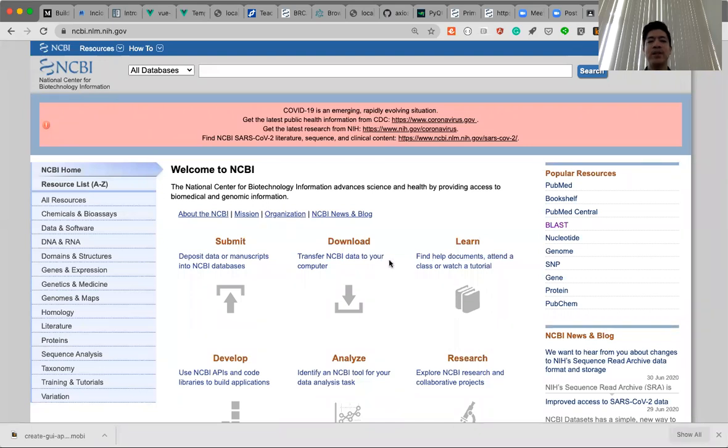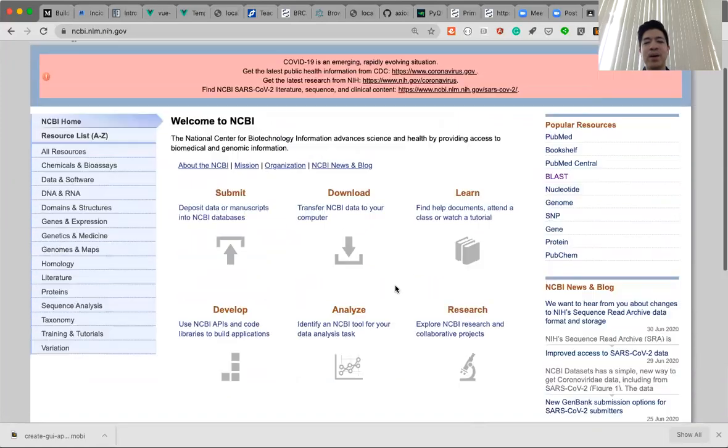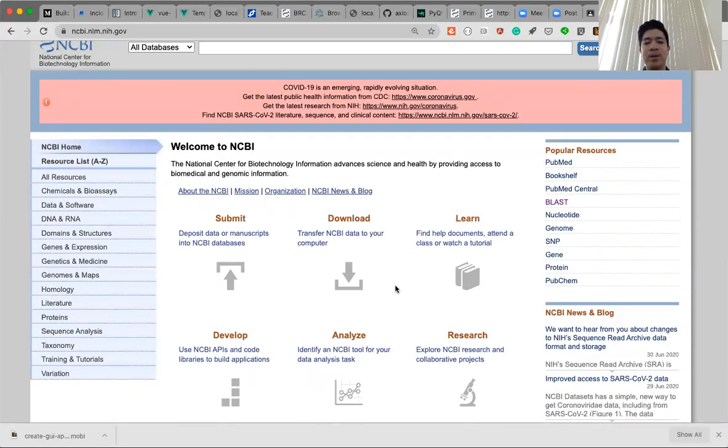This is something that I think is going to be useful, because most of your advisors will expect that you can do primer design after taking the bioinformatics course. Actually, it's pretty simple, and as I said before, the tricky part of designing a primer is going to be the biology of your gene or your sequences, not the tool. Right? If you know better about the biology of your research, of your organism or gene, you can design a much better primer.